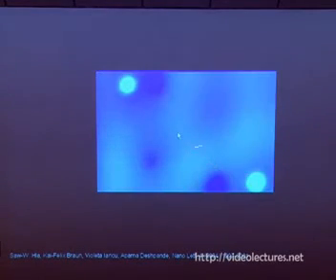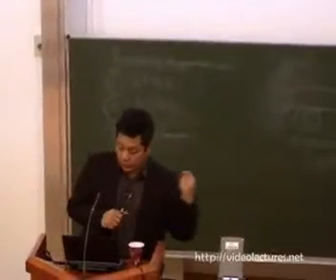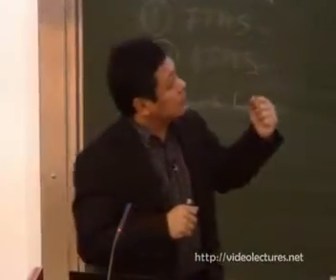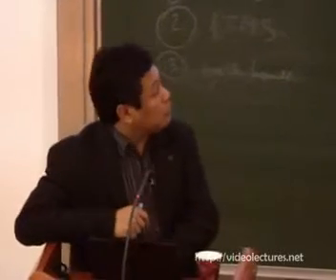And this is the proof that these atoms are substrate atoms. We fill back a small hole, and as you see, after filling, the hole is completely gone. You see nothing. It's not distinguishable from the neighboring area. This happens only if the atoms are the same material as the substrate. For example, in this case, this is silver 111, so these atoms are silver. If we use other types of atoms like tungsten or copper, we will see changes here, because the electronic structure is not the same.